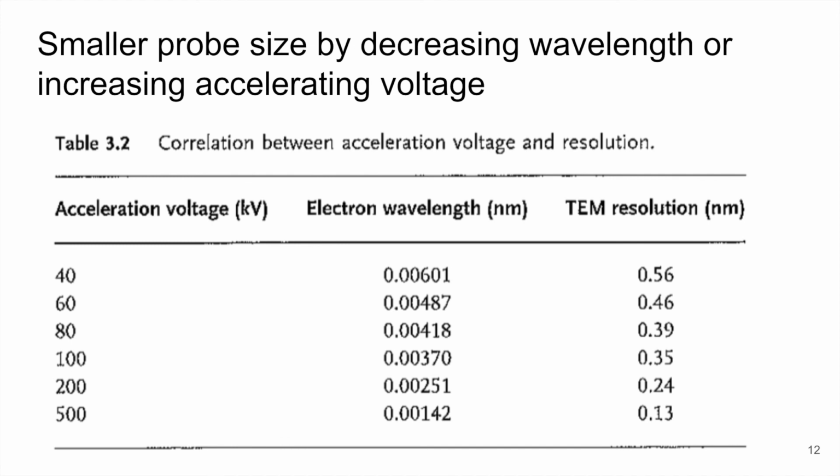All right. So the last part that we didn't mention as much, and this goes to the wavelength. The wavelength isn't something, if you sit down at an SEM or a TEM, that you can think of as turning a knob. You're not directly changing the wavelength, but you can adjust the wavelength by adjusting the acceleration voltage.